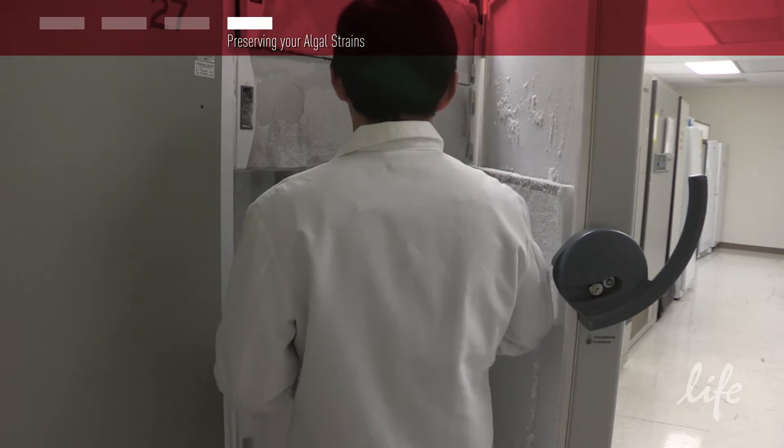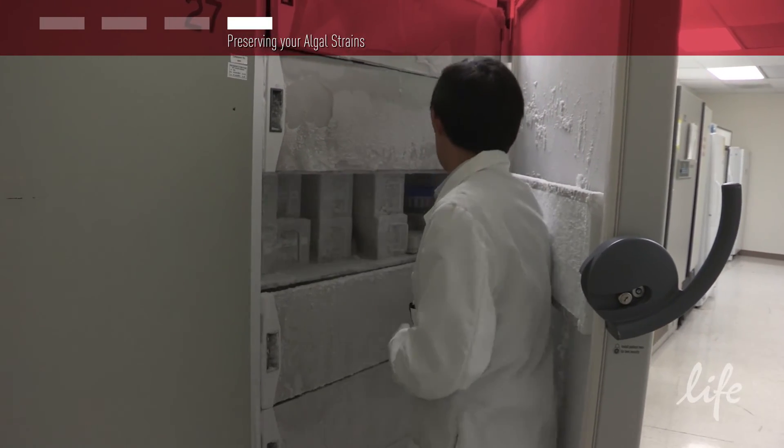Finally, transfer the Nalgene Mr. Frosty to the minus 80 degrees Celsius freezer.